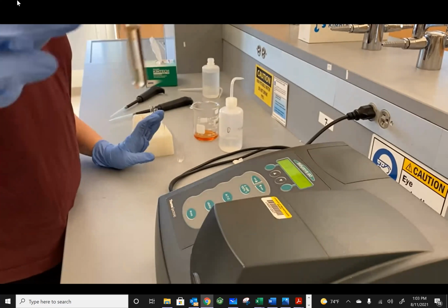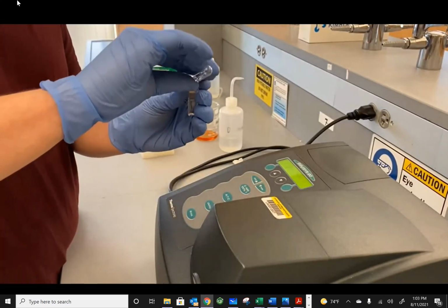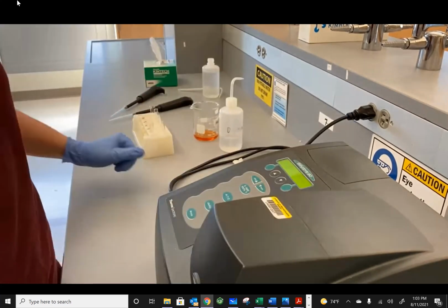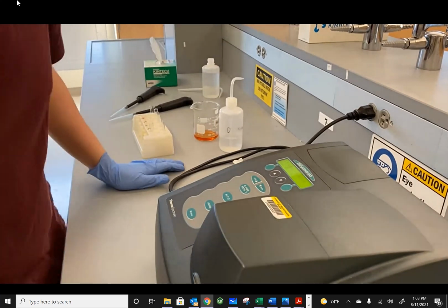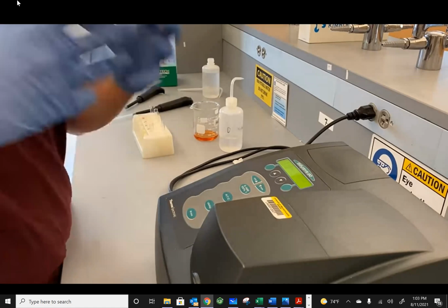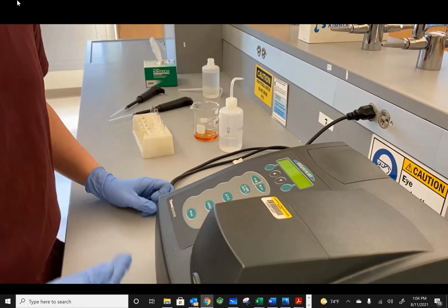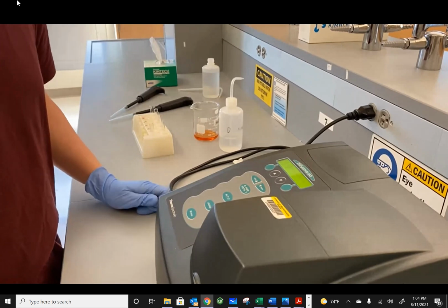Now, once this is mixed, once this is ready, we take this and we deposit it into our cuvette. Make sure there is enough to measure. Take the cuvette, and insert it in the spectrophotometer. You take a measurement. And once we take the measurement, we will record a data set for you and send it to you so you can do the rest of the math and do the lab report for this experiment. We will send you 4 different test tube absorbances, and you will do your math from there.